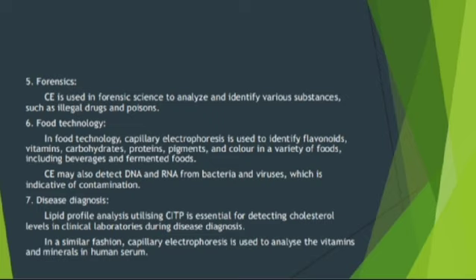In disease diagnosis, capillary electrophoresis for lipid profile analysis utilizing CITP is essential for detecting cholesterol level in clinical laboratories during disease diagnosis. In a similar fashion, capillary electrophoresis is used to analyze the vitamins and minerals in human serum.